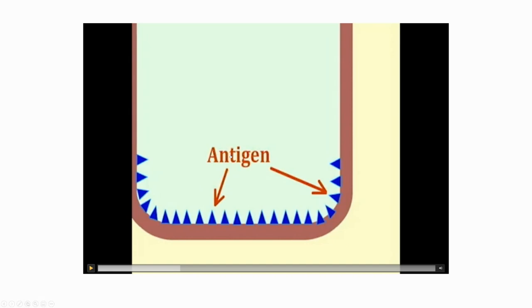So if you have antigen, you coat here. That means you're going to detect what? What you try to detect now here for this video? The sample antibody? Antibody, yes, very good. So this is an indirect ELISA, okay?